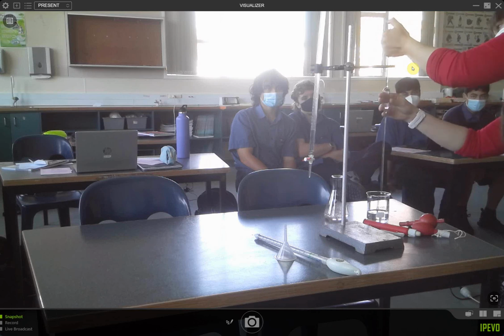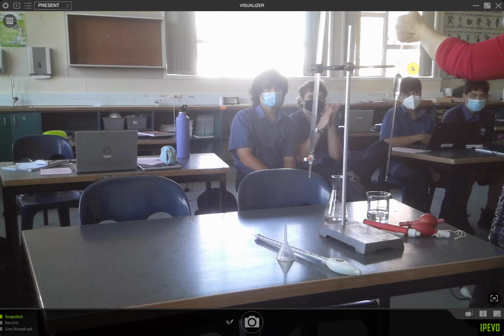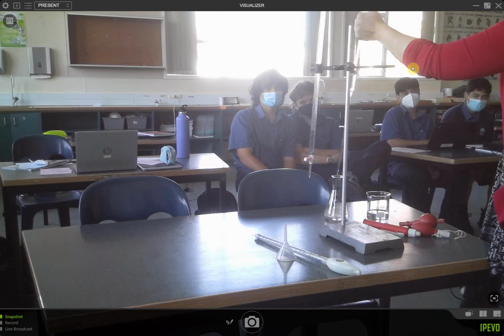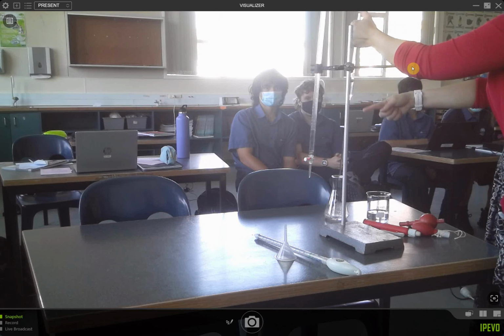But first, before you even do that, you're going to release your hand just a bit, so that the suction breaks and some of that liquid comes out. Then you stop it so the bottom of the meniscus is next to the line. Dry it off, and then you put it into a flask, and this is known as an aliquot. So what's in here is the aliquot, and I release it.